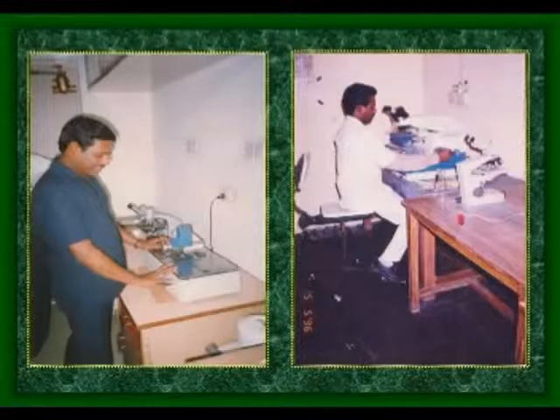After fixing the knife holder, you are already making a block also as a pyramid-like structure. So the block should be kept in the block holder, and the knife should be kept in the knife holder. After fitting tightly, adjust the microtome. Before taking the sections, the microtome should be thoroughly checked. All the accessory parts, whether they work or not, you try to adjust manually first.